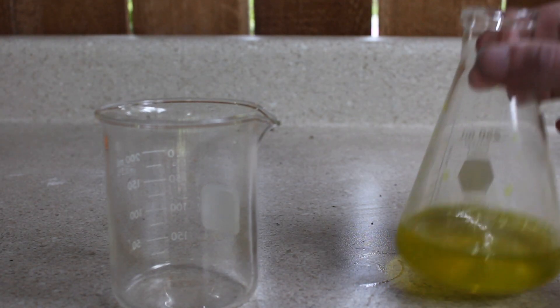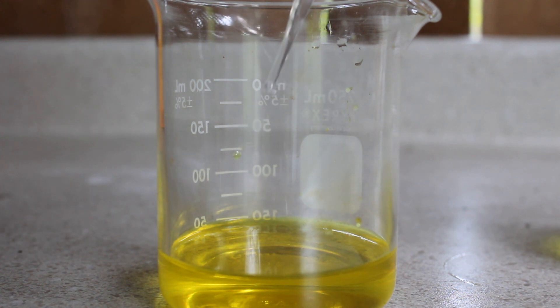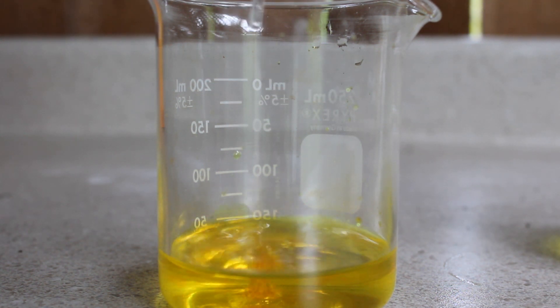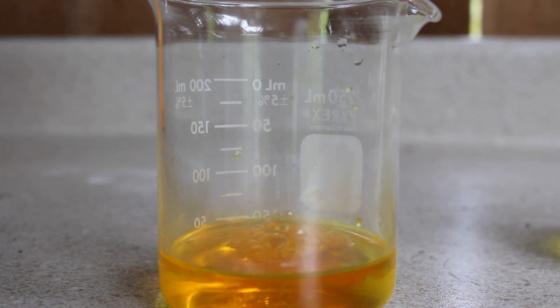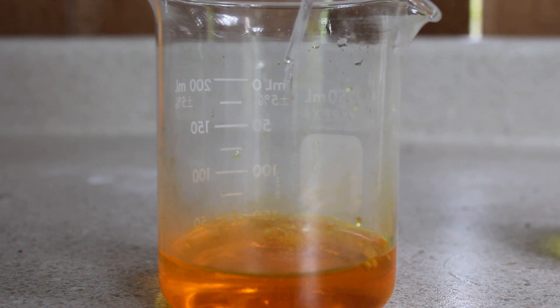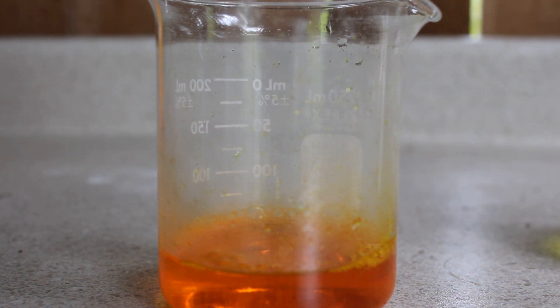I add about 50ml of this solution to a 250ml beaker. Then I start adding small amounts of sulfuric acid to acidify the solution. The bubbling and fizzling you're seeing here is just the sulfuric acid reacting with leftover sodium carbonate that is still in solution. You can also see that the solution went from a yellow to an orange color, letting us know that we have sodium dichromate in the solution.